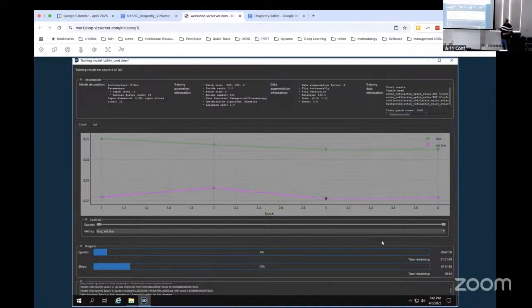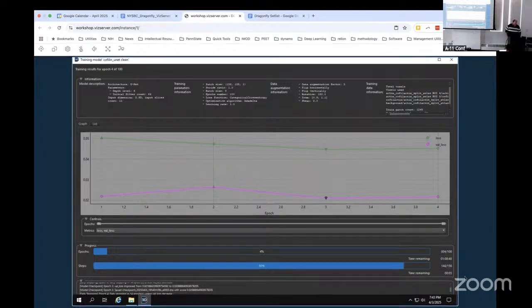This is an already trained network and it's already seen a lot of this data, so it's actually not going to drop really far. In fact, it'll barely drop at all. We'll just watch it go for a few more epochs and then we'll see what we can get away with. You let yours continue to run. I'm going to stop mine and see after 5 epochs what it looks like.